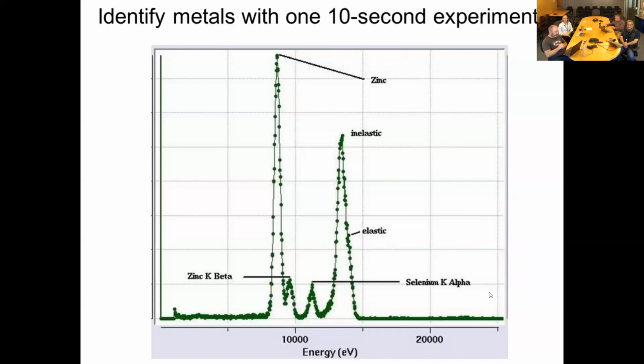I run Beamline 831. And one thing I just realized we should tell you about is this quick excitation scan, fluorescence scan experiment. The beamlines that have vortex detectors can do this. The nice thing about ALS-ENABLE is you don't need to worry about that. Just tell us the science you want to do, and we'll assign you to a beamline that can do this. This is a 10-second experiment that'll tell you all the elements that are in your sample. So if you've got some site, could be a zinc, could be a nickel, you're not really sure, this will resolve that. It's very fast. It doesn't even do a lot of radiation damage because the beam is heavily attenuated for these scans.